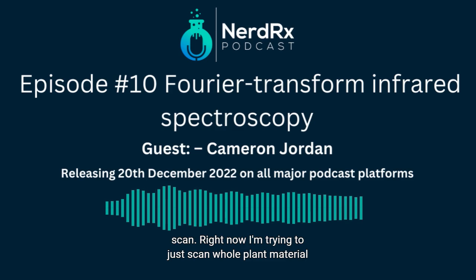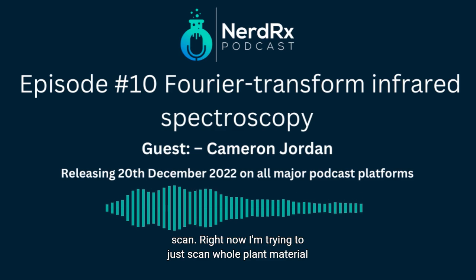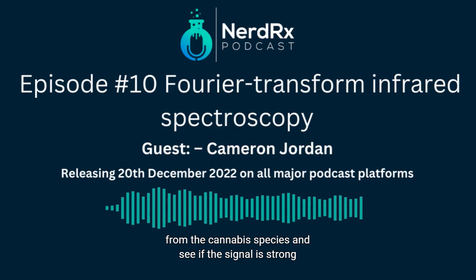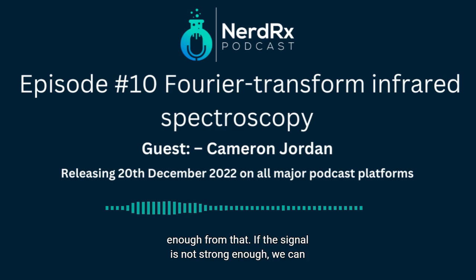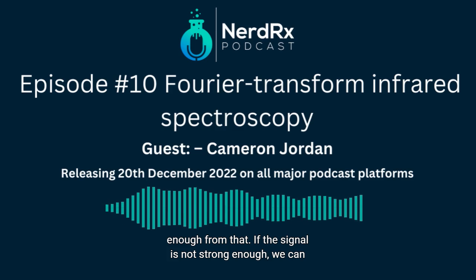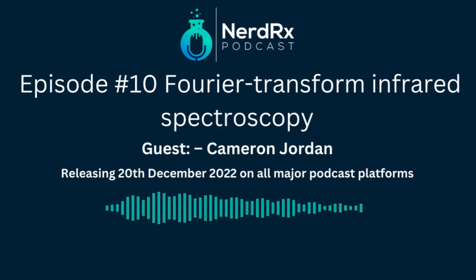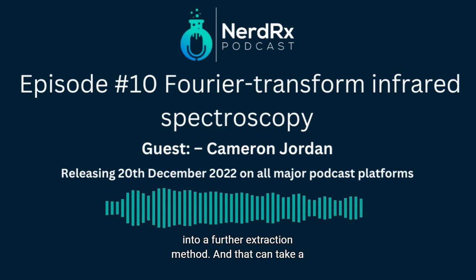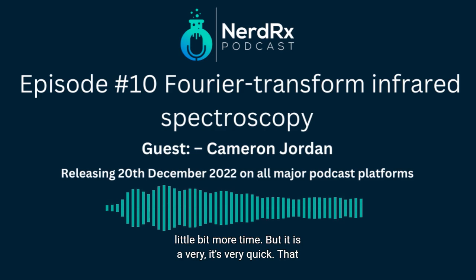Right now, I'm trying to just scan whole plant material from the cannabis species and see if the signal is strong enough from that. If the signal is not strong enough, we can further powderize and reduce the particle size and see if that works. If that doesn't work, we'll have to move into a further extraction method, and that can take a little bit more time.